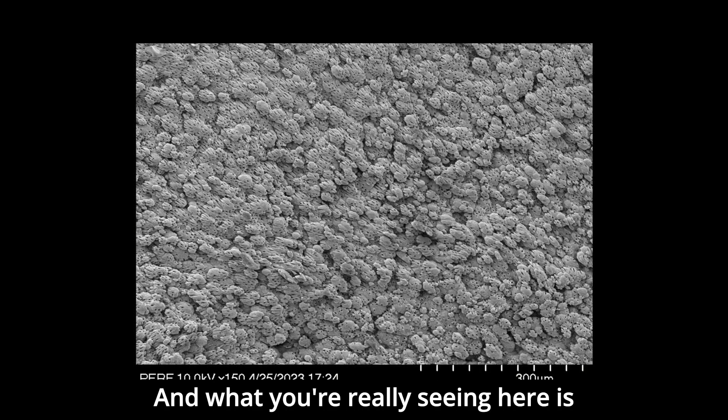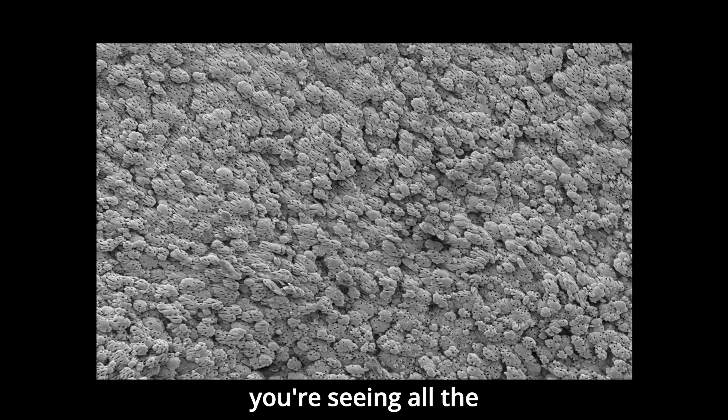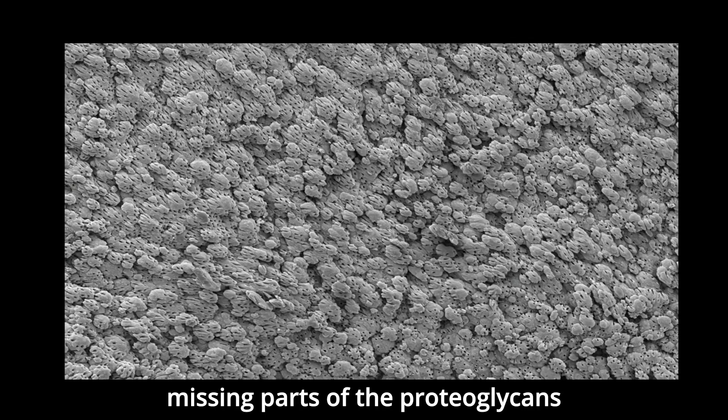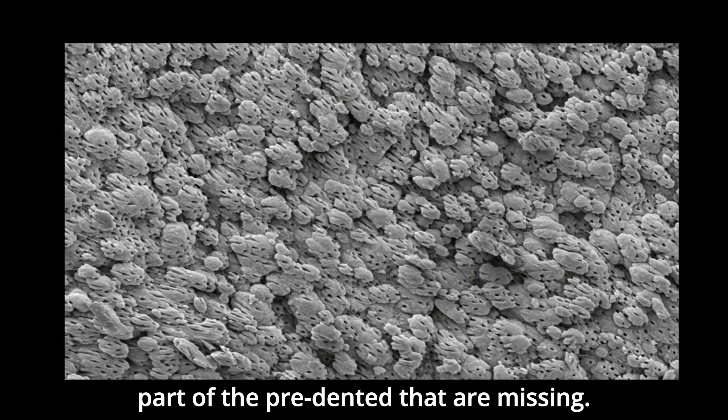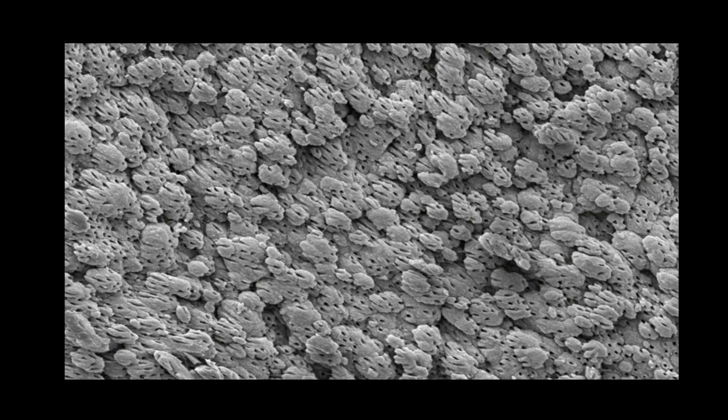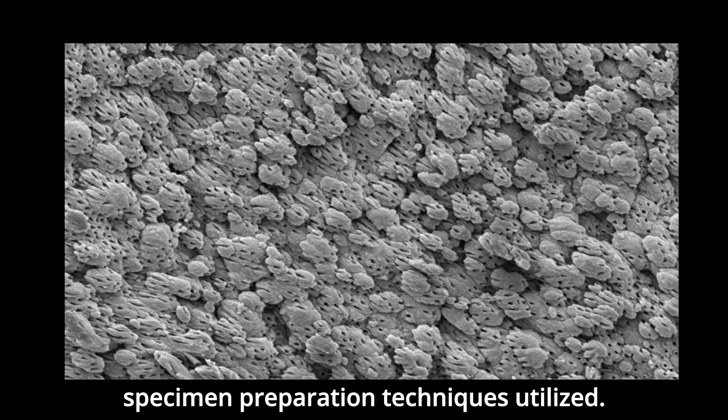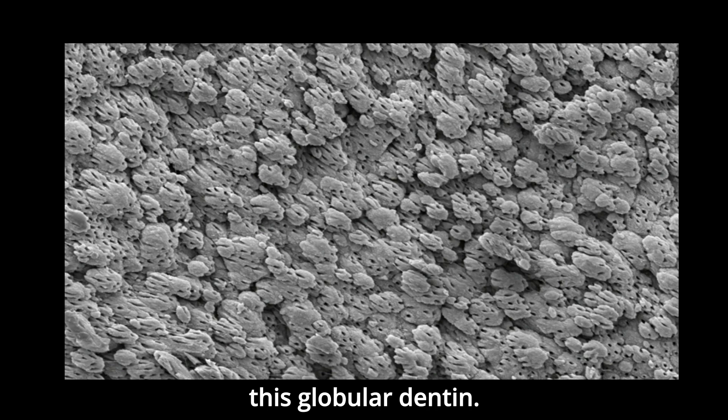And what you're really seeing here is all the missing parts of the proteoglycans and non-collagenous proteins that are part of the pre-dentin that are missing. They're missing on account of the specimen preparation techniques utilized. So you're looking at this globular dentin.